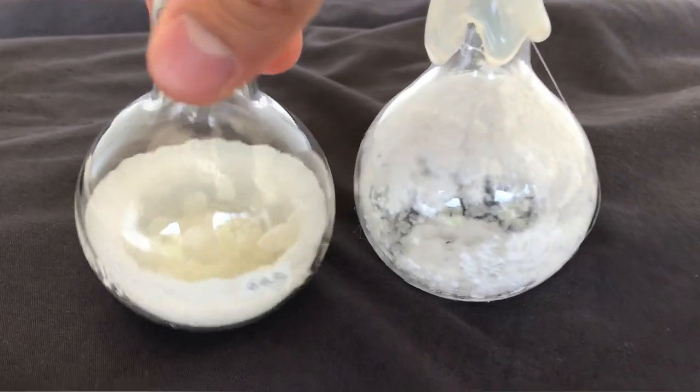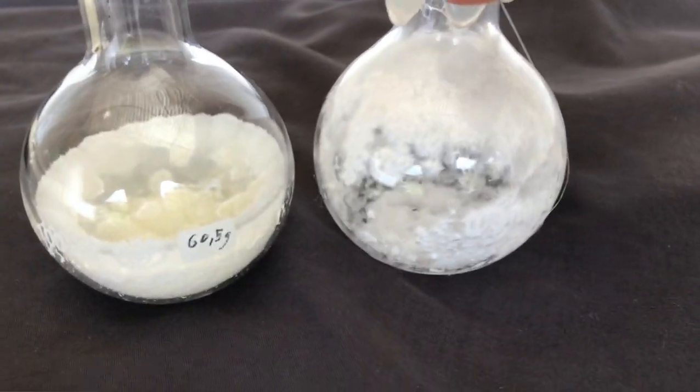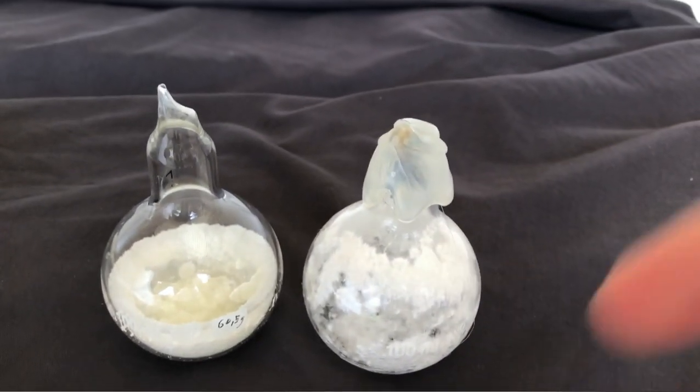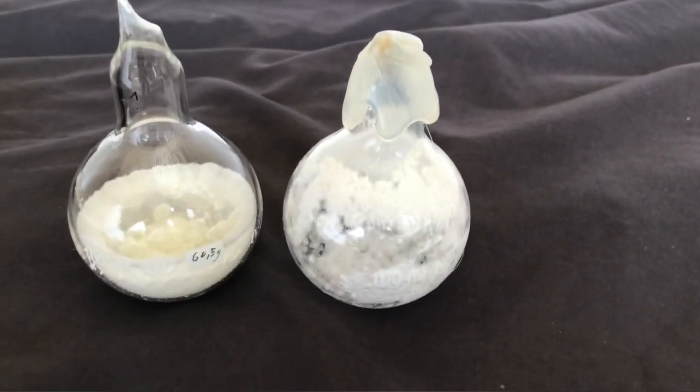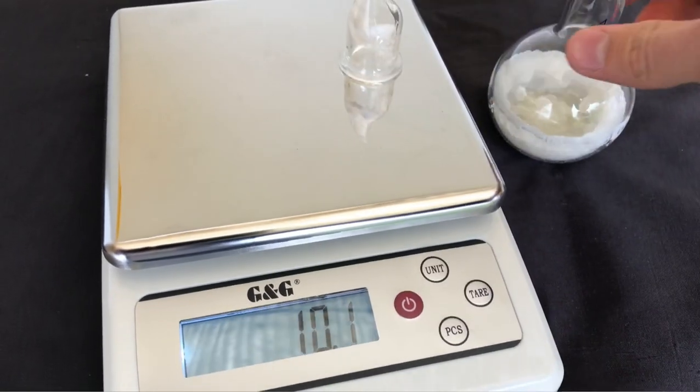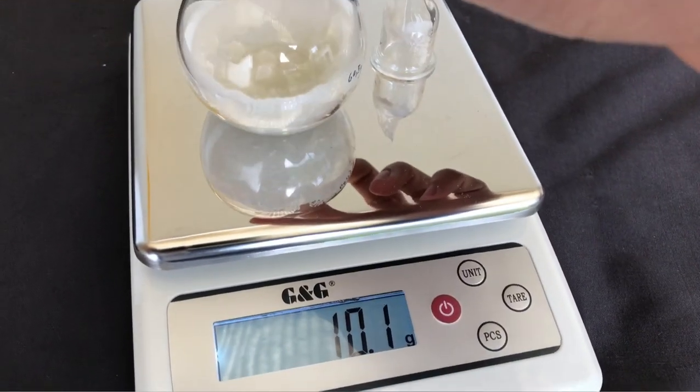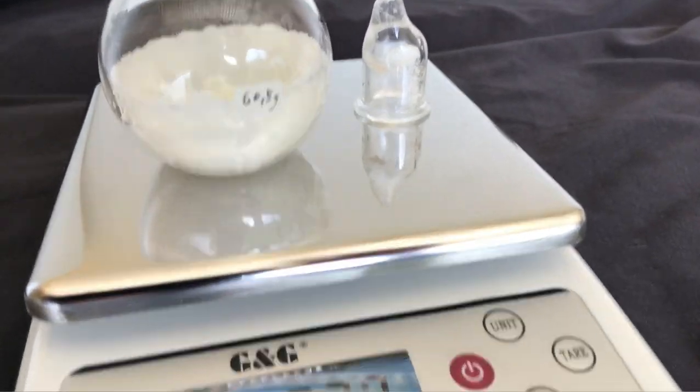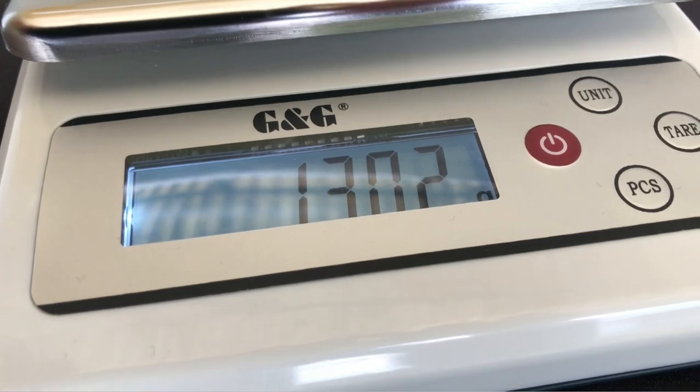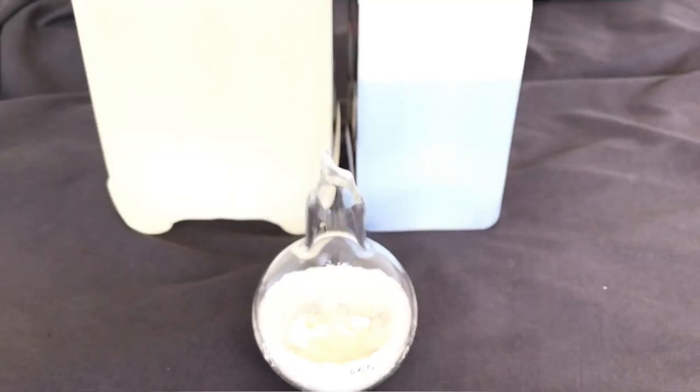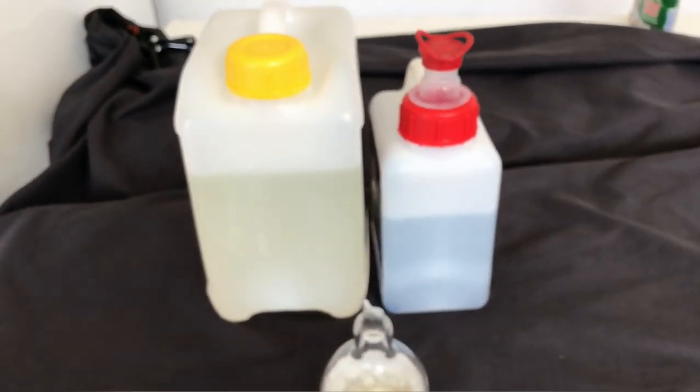In the end we were left with this. One ampule containing a lot of solidified sulfur trioxide and one ampule containing just a little. Sulfur trioxide makes really interesting needle-like shapes. The main ampule was weighed. By subtracting the weight of the flask and the amount of boric acid added, we come to the conclusion that 69.4 grams of sulfur trioxide were obtained. This is just the main flask and this corresponds to a yield of around 35%.